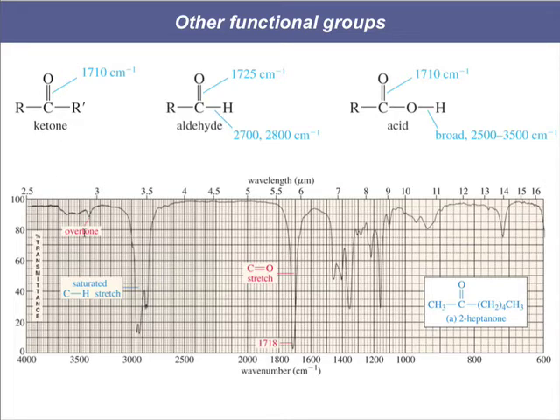Something very interesting that you often see in carbonyls are what are called overtones. I don't know if any of you are musicians, but if you've ever played a piano, if you take a well tuned piano and hold down the sustain pedal and then hit one note very hard, say middle C, you will hear other strings in the piano vibrating alongside the middle C that you hit.